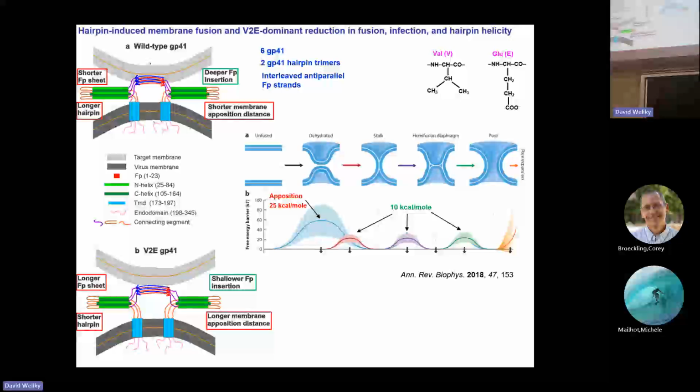We don't have a direct or quantitative number on the number of strands. The data we do have suggest maybe 20 strands per sheet, though it could be 6 to 10-ish molecules per beta sheet. You definitely will have multiple, separate beta sheets on a single vesicle. And in the solid state at the bottom, it's not likely that you have protein interactions between vesicles.